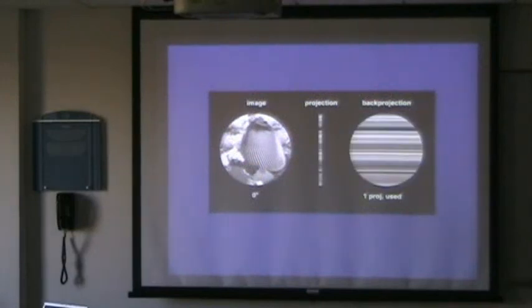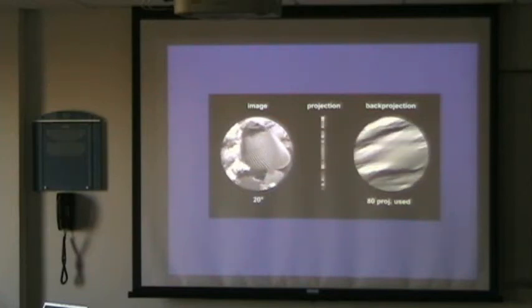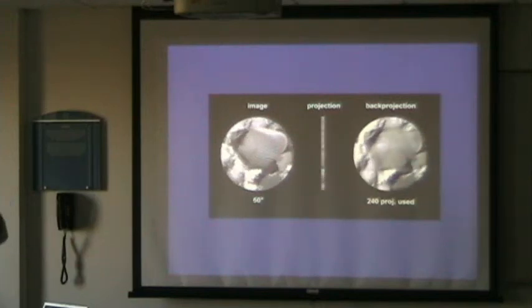So again, we have this issue with the projection and the missing wedge. What I typically can collect is, because again we collect tilt series in the microscope, but not of different crystals all over the place. We just take one existing real feature, whatever that is, a Golgi, whatever. And this thing we cannot tilt fully. So we get this kind of loss of information. You see here we lose the striation and stuff like that.